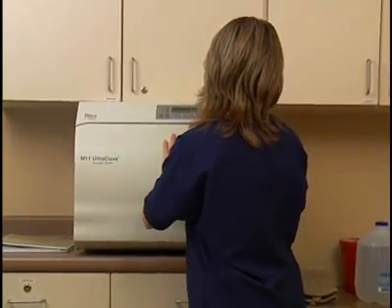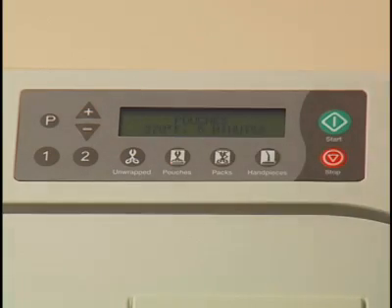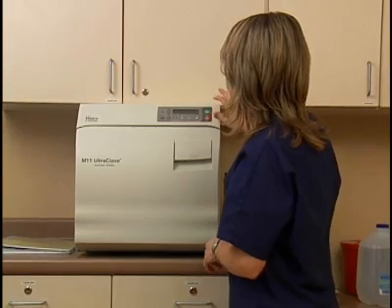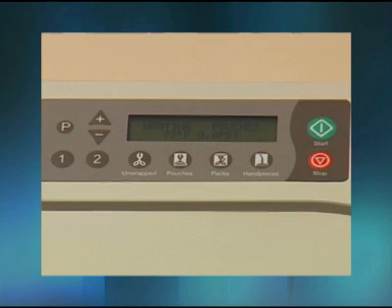Determine the sterilization cycle according to what is being autoclaved. Press the appropriate button on the front of the autoclave to select the program. Press the Start button. The display screen on the front of the autoclave will tell you what is happening automatically in the autoclave. These include: filling chamber is displayed when the chamber is filling with water. Heating up is displayed along with the autoclave temperature and pressure during the heat-up phase of the cycle.